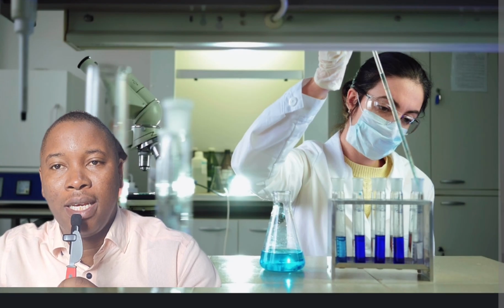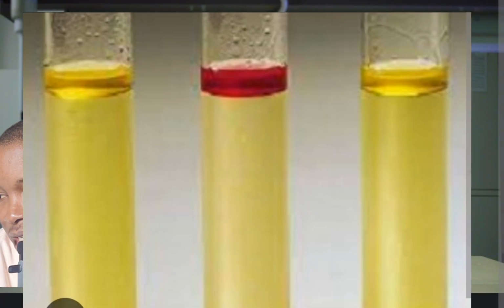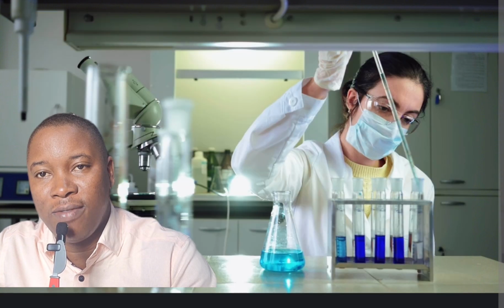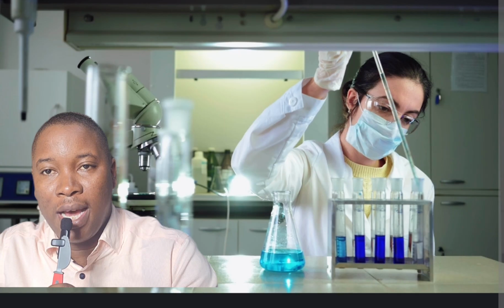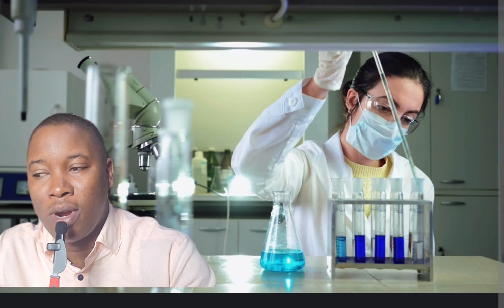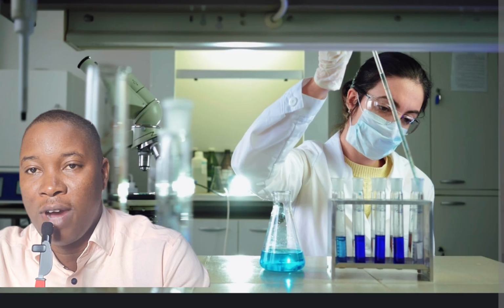So we need to add a reagent that we call Kovacs reagent. When we add this Kovacs reagent, there is a color change, with the development of a red or pink ring. When you see a red or pink ring developed within the broth, that tells you that the tryptophan in the broth has been broken down, and this is now detected by Kovacs reagent.